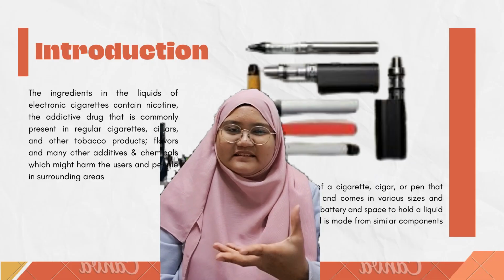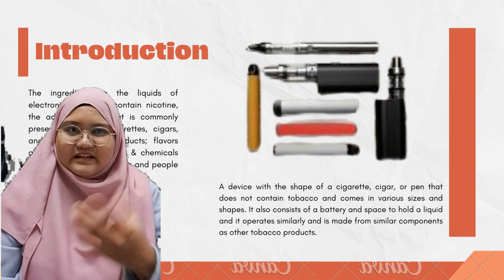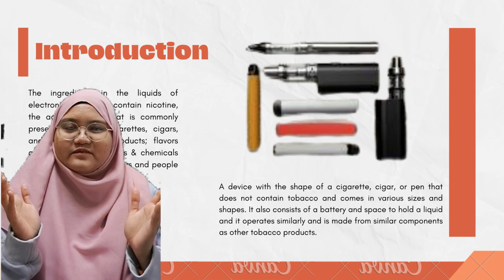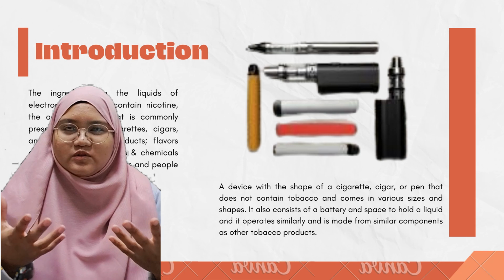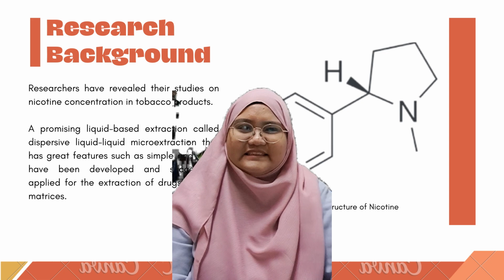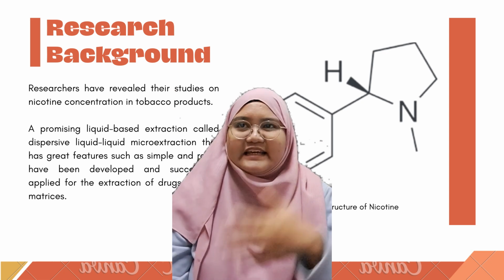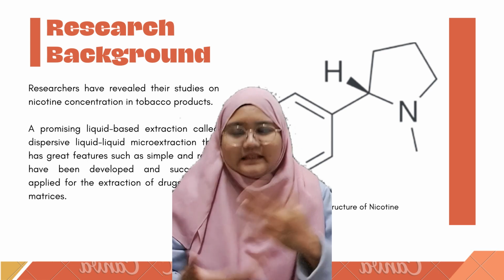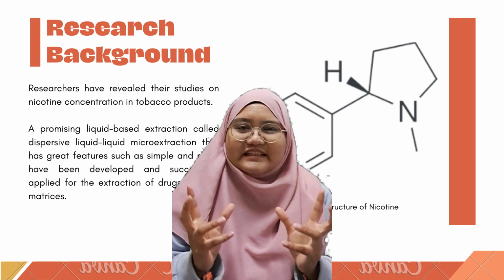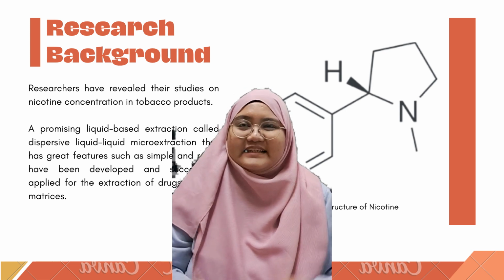Electronic cigarettes nowadays already contain nicotine in their flavor, and we know nicotine is a very harmful ingredient when it is exposed to the human, especially through respiratory. There is some research that many have previously studied the concentration of nicotine in other samples, especially in tobacco. But I would like to focus on the nicotine content in e-liquids, which is electronic cigarette liquids.